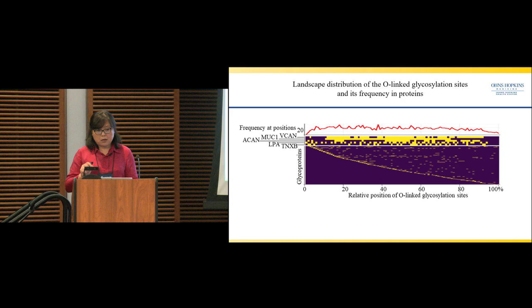They actually sit together, with hundreds of sites linked together without a proteinase digestion site. So normally those heavily O-linked sites are invisible by mass spectrometry. But using this method, you can see that for mucin, we can identify a number of sites close together, since this is an enzyme that can cut the O-linked glycosylation from the peptide portion, allowing us to release the O-linked glycopeptide for mass spectrometry analysis.